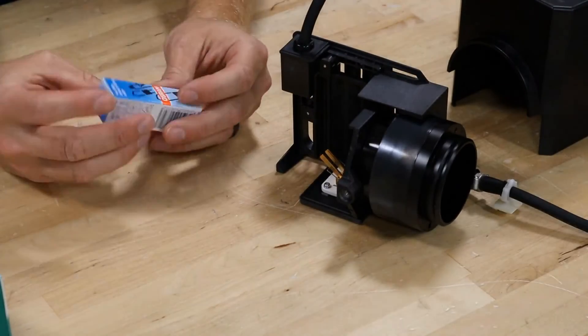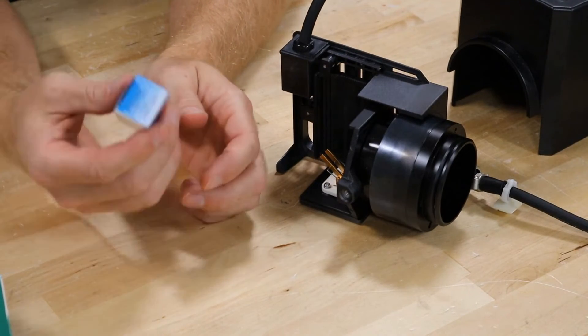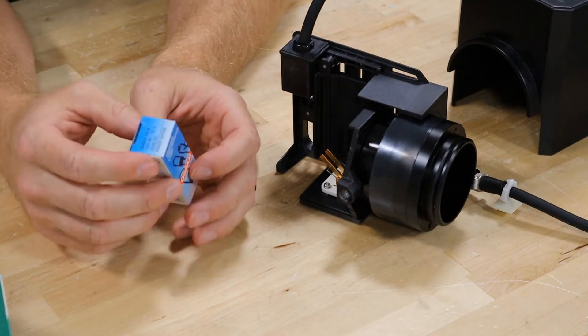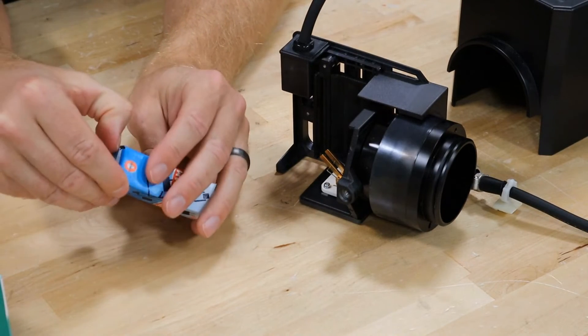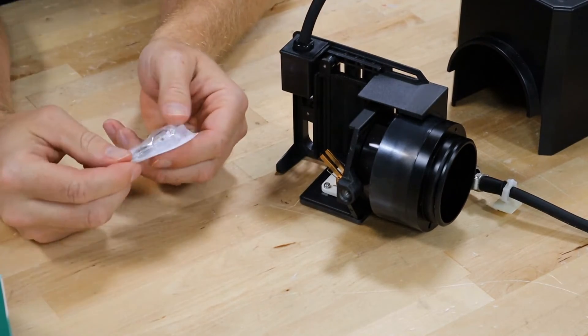Now that we have the old bulb removed, Chad is going to show you the new bulb we're going to be using, which is an Osram 12 volt 100 watt bulb. Here he's going to demonstrate how to take it out of the packaging without letting your fingers touch the glass, because you don't want the oil from your fingers on the glass as it can cause the bulb to fail early.